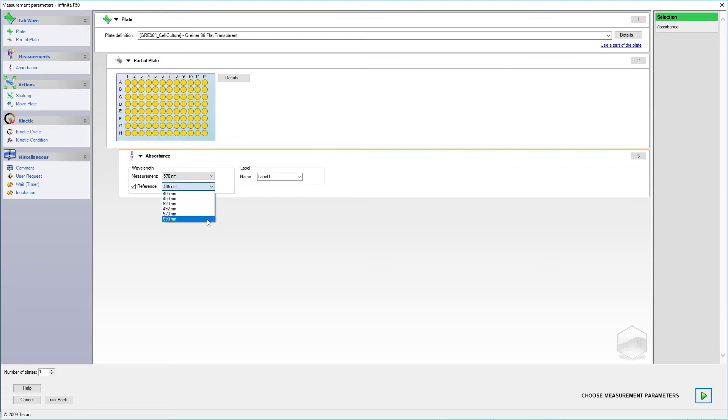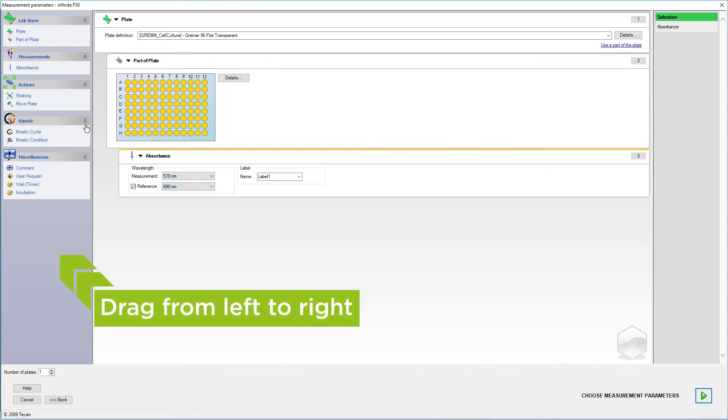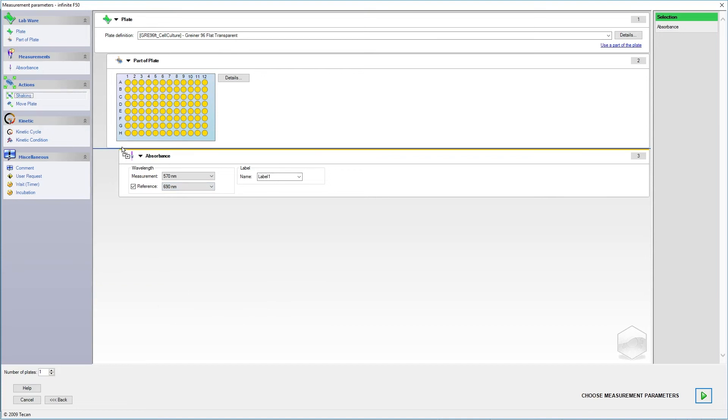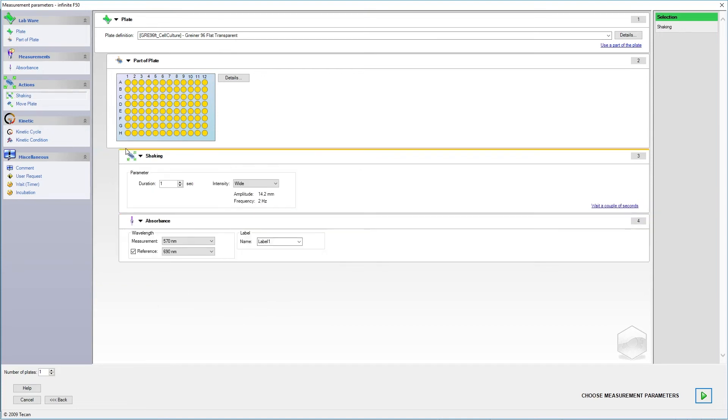New actions can be added to the method by dragging and dropping them from the menu on the left-hand side of your screen. Note that the measurement parameters are processed in a hierarchical manner, from top to bottom.